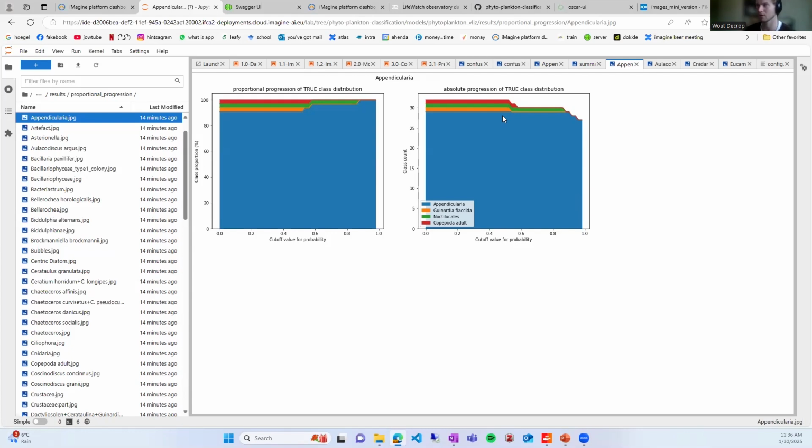Instead of looking at all the predictions that the model made to create a bigger model, you can, depending on the class, say, hey, from 90%, from 70%, from 100%, this data is good enough. And we'll take a look at the data we're less confident about and then see if there have been misclassifications here, so we can retrain a model in a better way.